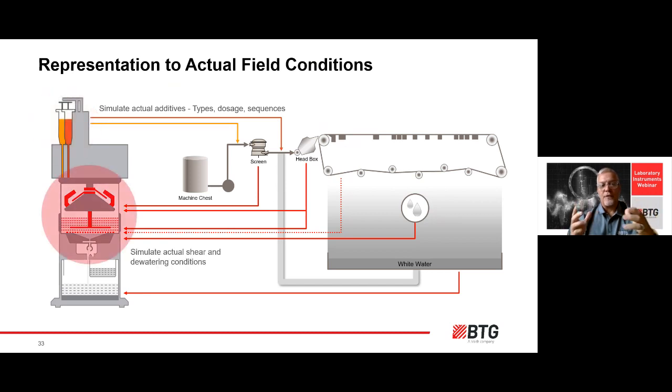The shear under the forming conditions can be adjusted. It is much better to create a flow-through of material that allows for retention measuring and drainage rate review than standard work on the freeness or the Britt jar, where everything just runs through.